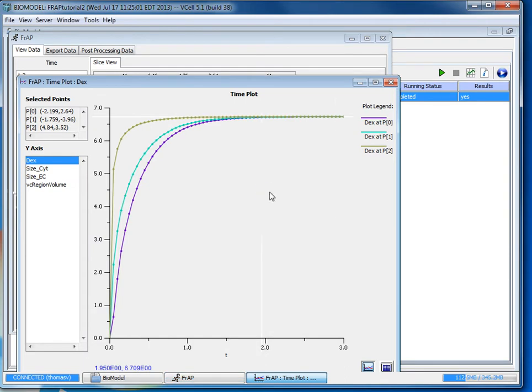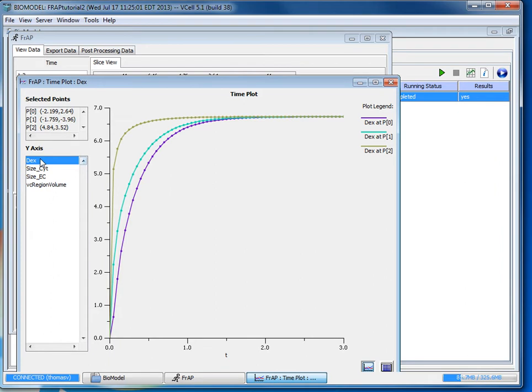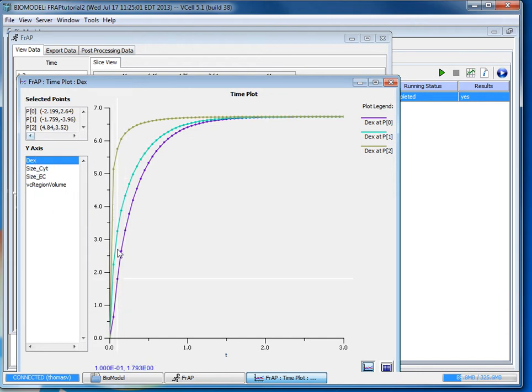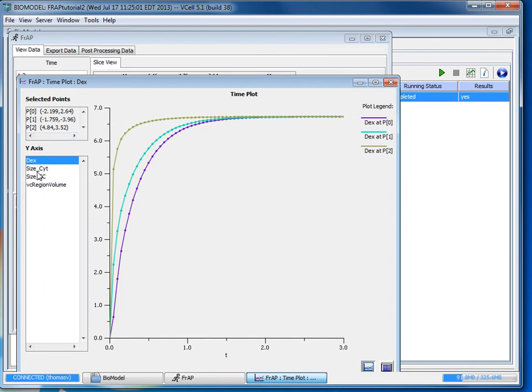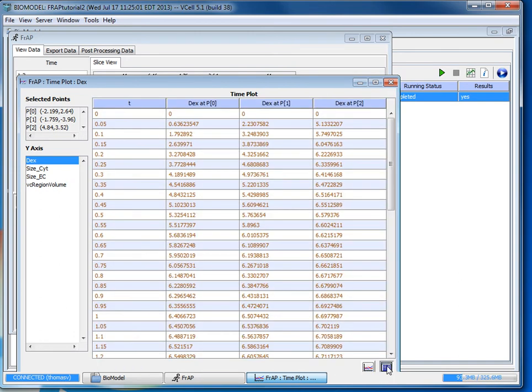It'll create a time plot for you and it'll display data for each of the points you selected for the concentration of dex. If we had created other species within this model you could select them and it will show the concentrations of those species at this point. But these three, the sizes and the volumes, those are constant they don't change.